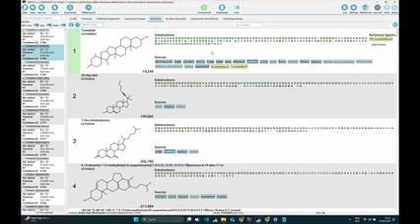So in my work, I investigate the interaction between plants and fungi. Plants defend against fungi that produce phytotoxins, and the fungi produce sesquiterpenoids, and it happens that these molecules blend, so we have this chemical mixture. If I use CANOPUS, I get the annotation of one class, which is wrong, because it's a mixture of these two groups.